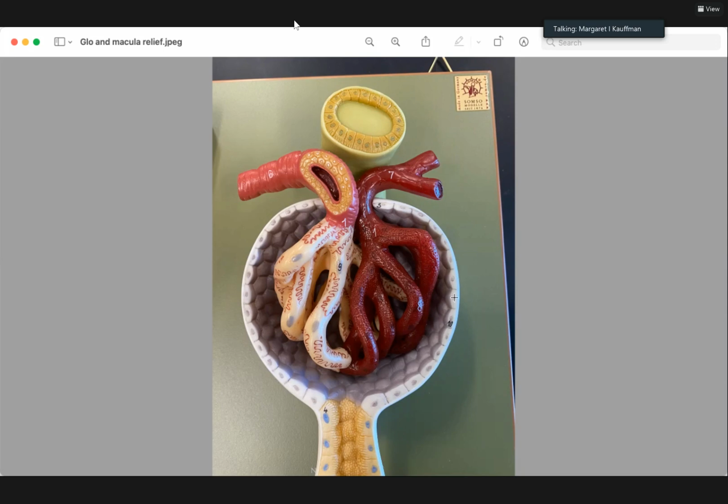And not worrying about loops of Henle. Those are all tubules. Tubular, that's part of the kidney, not the circulatory system. So PCT is over here, and we kind of know that because they made it look like there are microvilli on the surface of the cells. Again, parietal layer with all their tight junctions.